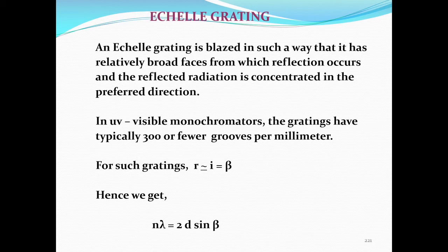So, what is an Echelle grating? An Echelle grating is blazed in such a way that it has relatively broader surfaces, that means very few reflection lines. So, reflection occurs and the reflected radiation is concentrated in the preferred direction.